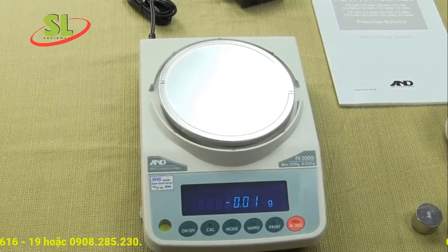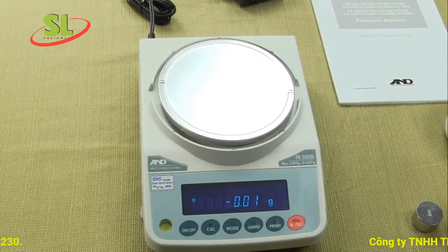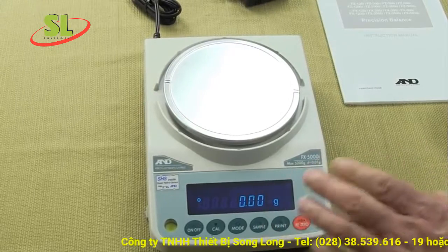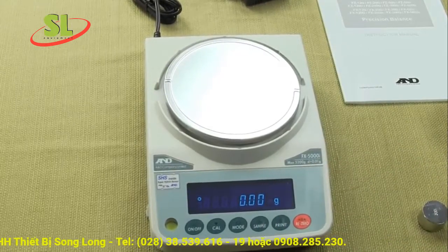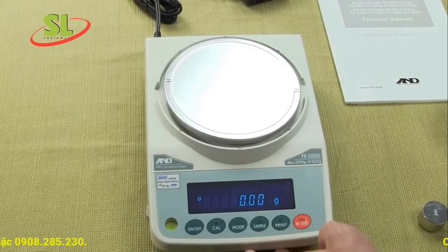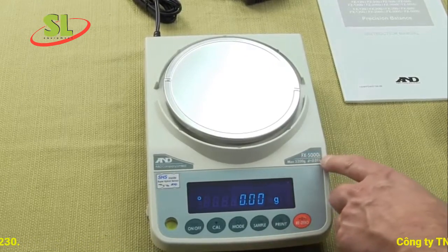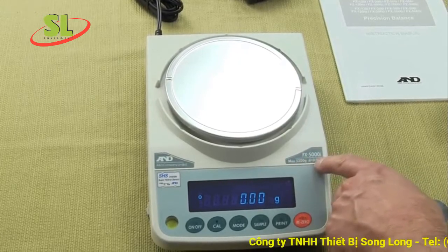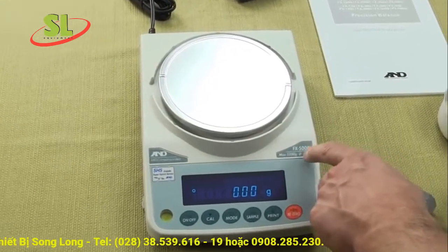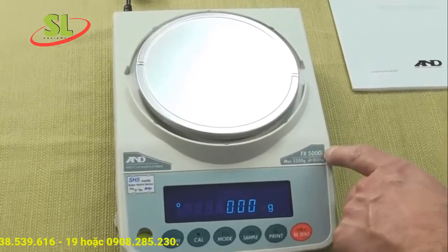Some models in the FXZ series have the ability to select two different calibration weights, while others have five. For 2012, A&D introduced the FX5000i, which is the 5200 gram by 0.01 gram model, and there's also an FX500i, which is 500 grams by 1 milligram.